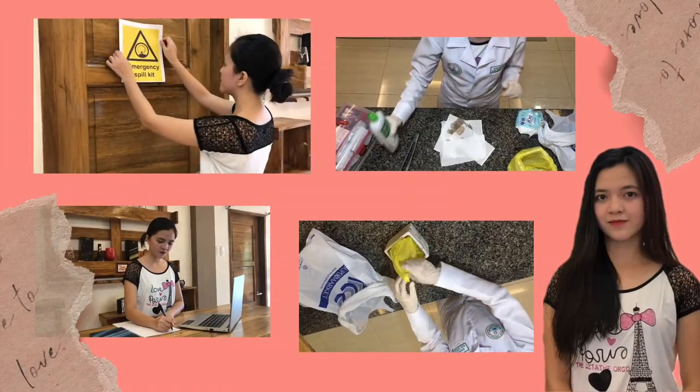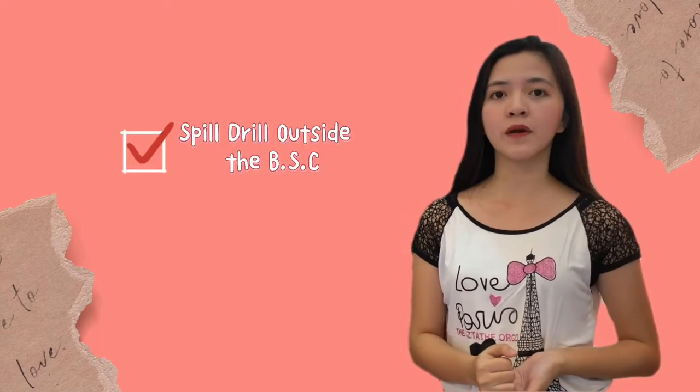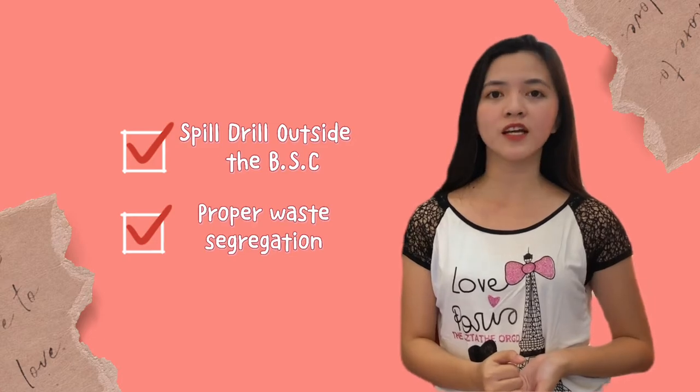Hi guys! This is Daryl Joyce Arboreda. For this video, I will discuss two topics. First is the spill drill outside the biological safety cabinet, and the second one is the proper waste segregation. So, let's start!